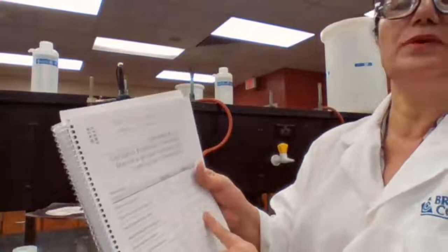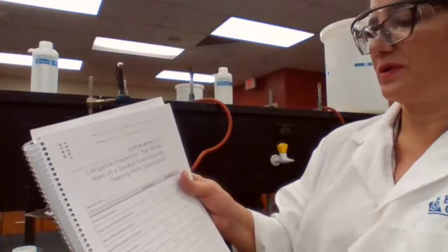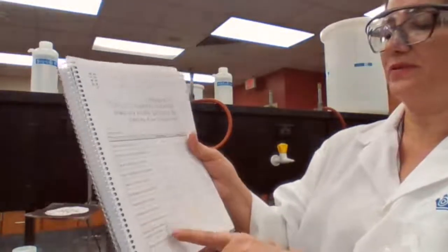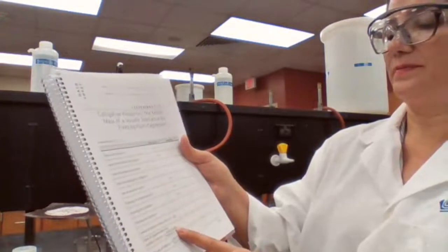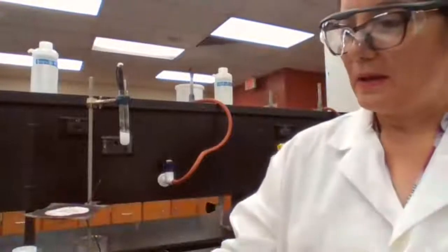You have the freezing point of the benzophenone. That was the first number, the 52.8. And then we have the freezing point for the solution. Then you can calculate the delta TF, and from delta TF you can calculate the molality, you find the number of moles, then you find the molar mass. So the calculation is also shown here.